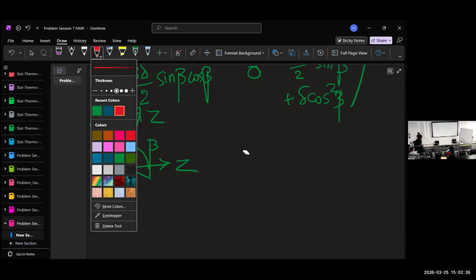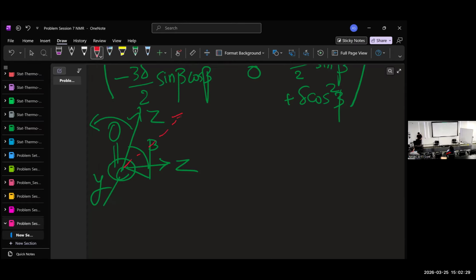That's kind of how I'm describing this problem: the molecule is rapidly exchanging between these two conformations, and the two conformations don't have the same principal axis system. And remember, all of this is being defined relative, for example, to B naught. So you have a molecule with a certain orientation of the z-axis relative to B naught, which is again given by your powder angles, which show up in a static average of frequency or the MAS.